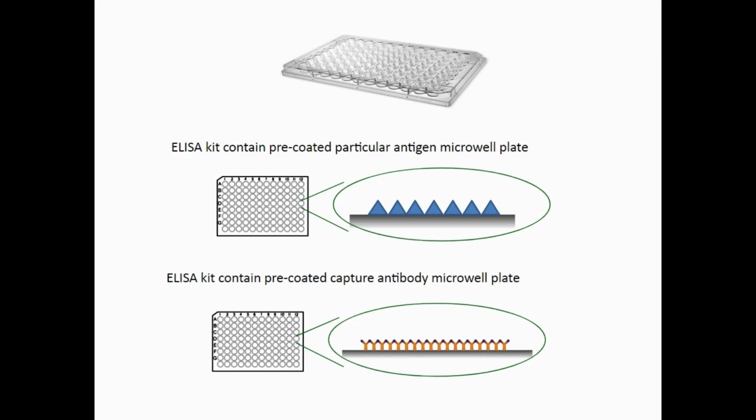For example, a patient is suffering from hepatitis A. Hepatitis A is the antigen, and the patient's immune response produces antibodies against that specific virus, and those antibodies are specific for that particular hepatitis A antigen. Those will be called primary antibodies.